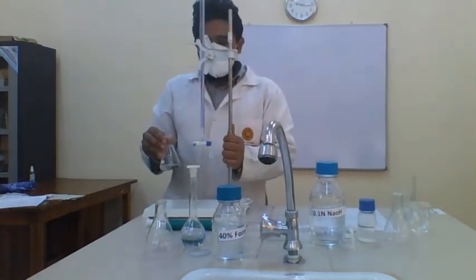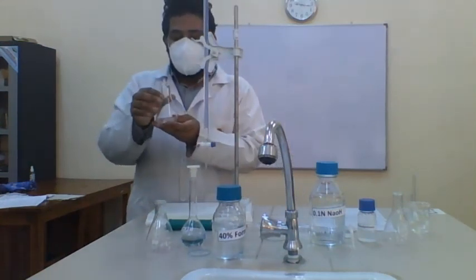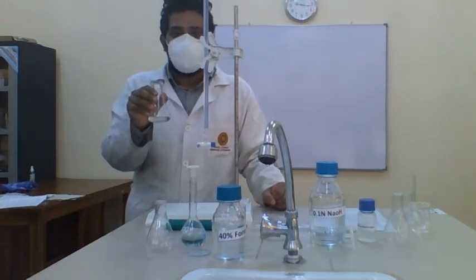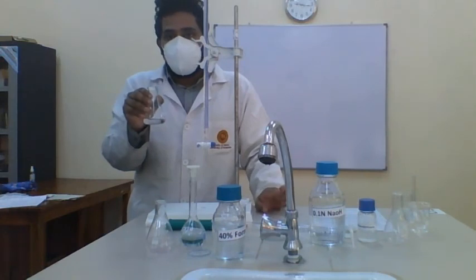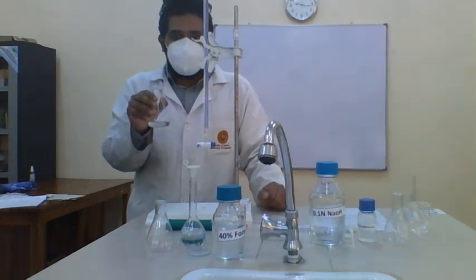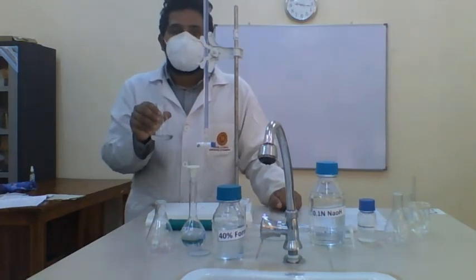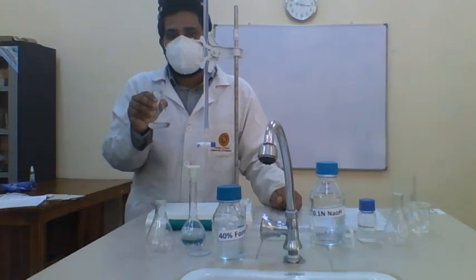Then, as the major titration of this experiment, we are going to titrate this mixture against 0.1 M sodium hydroxide. Actually, this is a strong acid, strong base titration. We are doing all the steps in order to prepare a strong acid. Then the Sorensen form of the amino acid is a carboxylic acid.